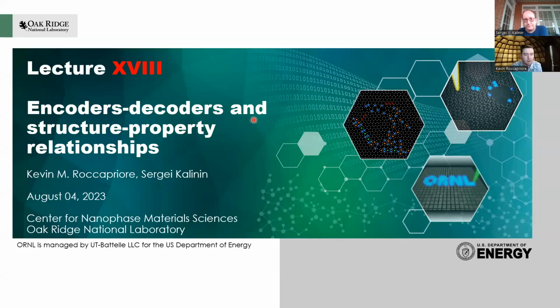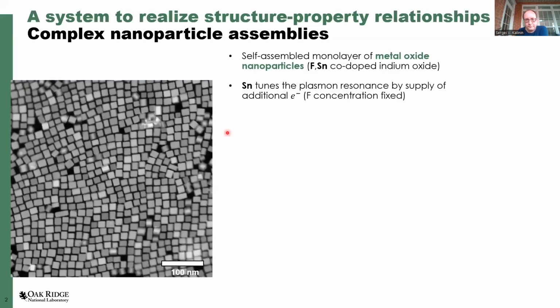So yes, today we'll talk about these autoencoders, or encoder-decoder, in electron microscopy. So let me go ahead and get started. One of the good systems to effectively play around with this is these complex nanoparticle arrays in different geometries.